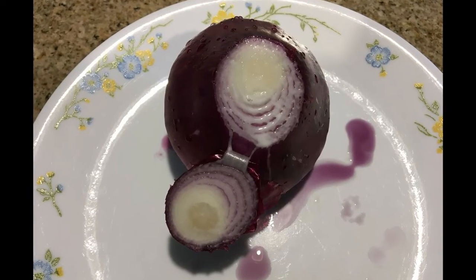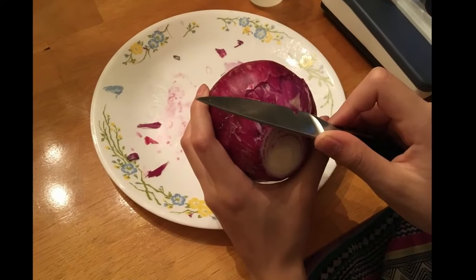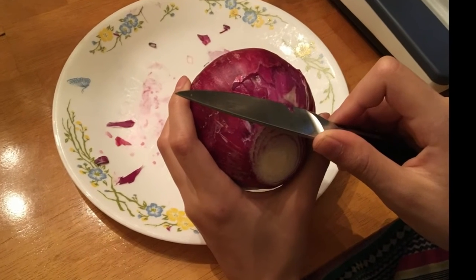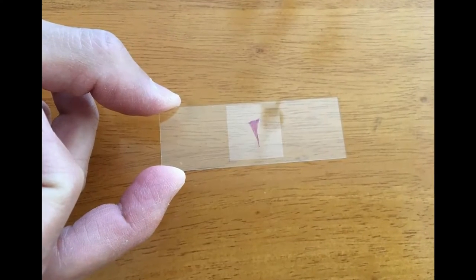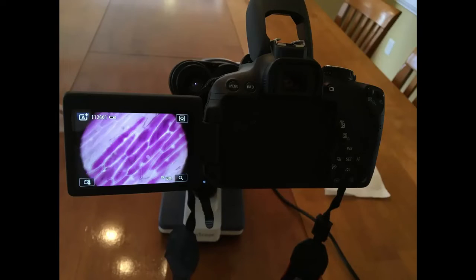Next, prepare the onion by cutting the bottom off. Carefully peel a very thin layer off the red onion with the knife. Place the small onion piece on a glass slide and place a cover slip on. Attach the camera to the microscope and view the onion under the microscope at low magnification.